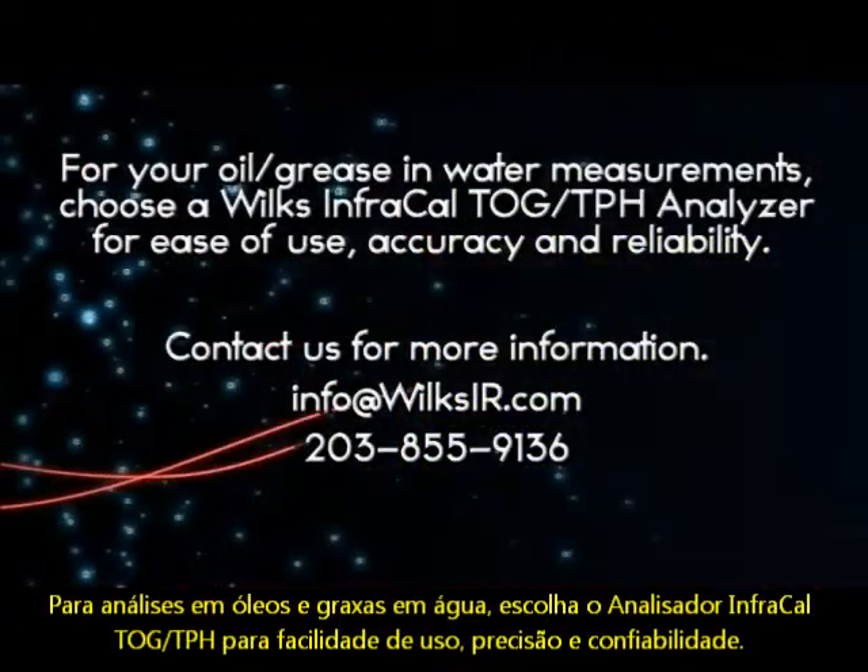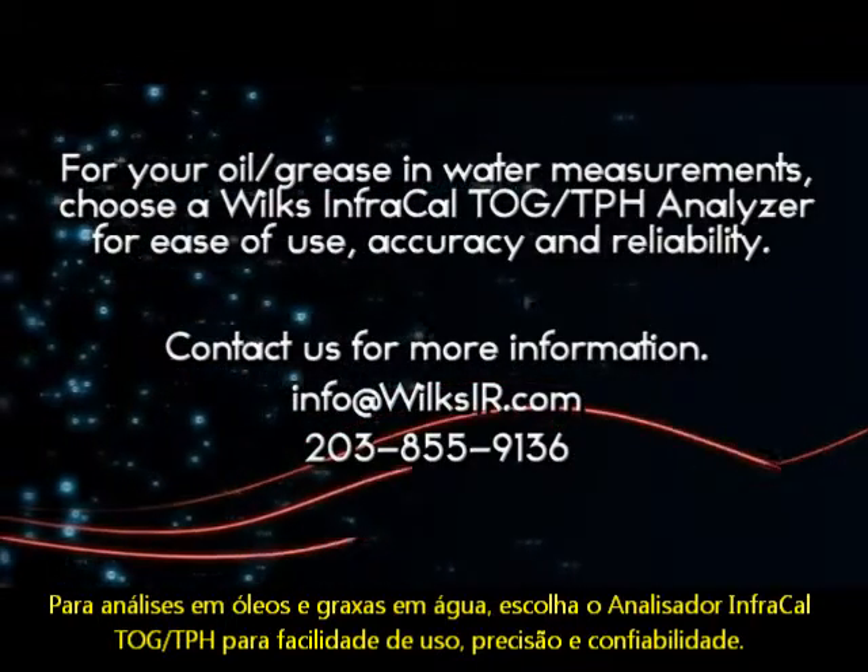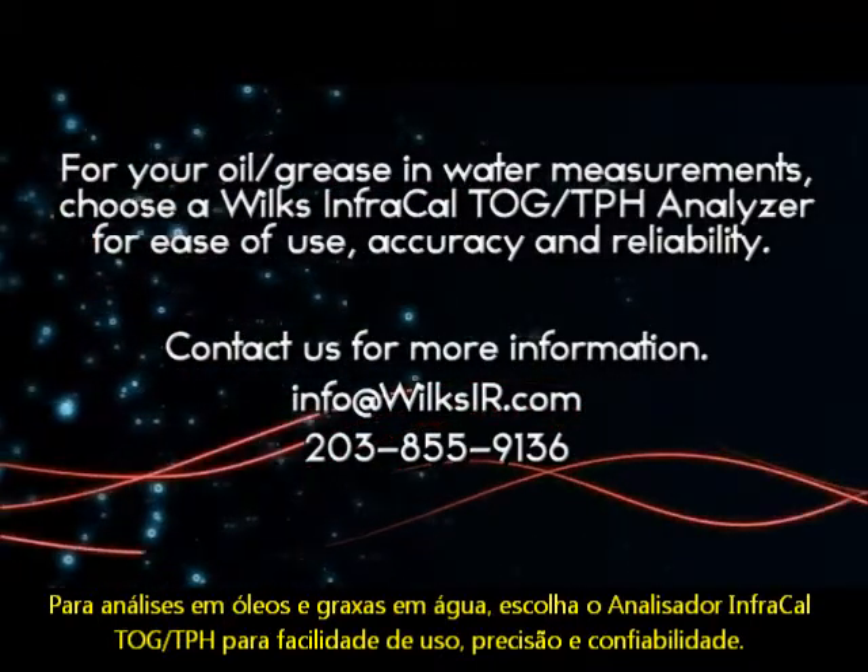For your oil or grease in water measurements, choose a Wilks InfraCal TOG TPH Analyzer for ease of use, accuracy, and reliability. Contact us for more information.